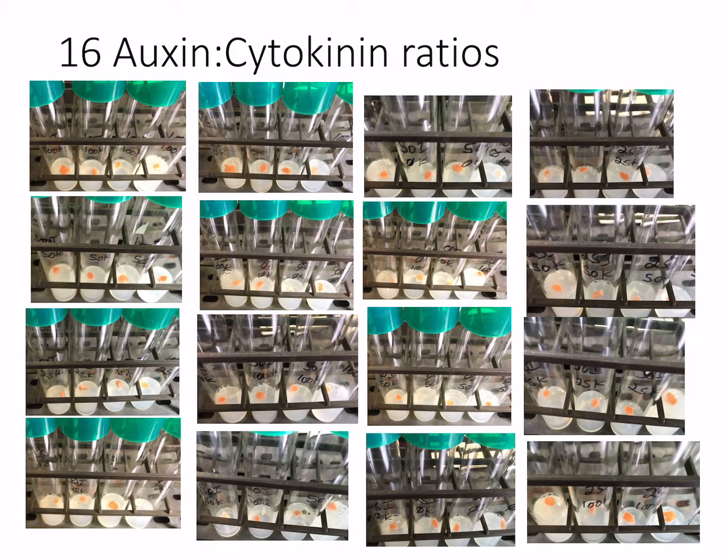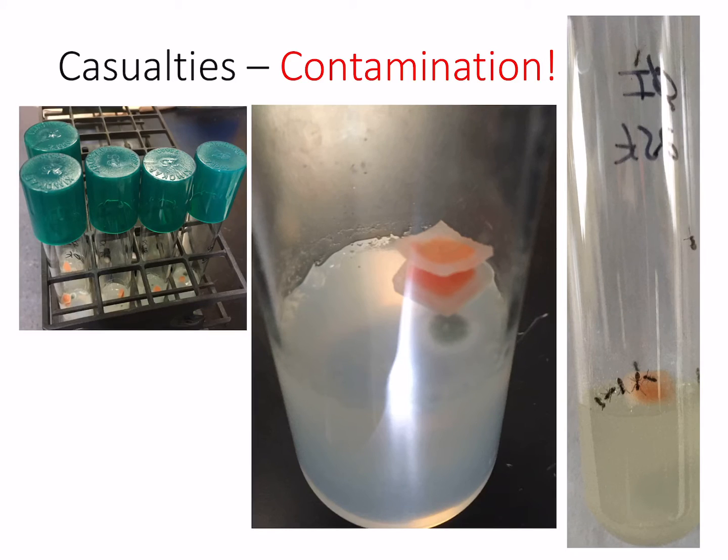For the other 16 hormone concentrations, I didn't see much going on, which is why I put all those pictures together as a group of 16. Some showed a little swelling, but for most of them, not much was happening. Something I did notice that was different from the Petri dishes was contamination in these culture tubes — perhaps I carried something over when I prepared them.